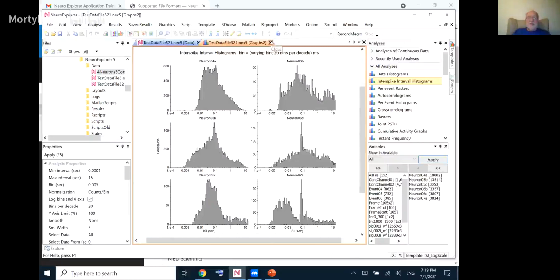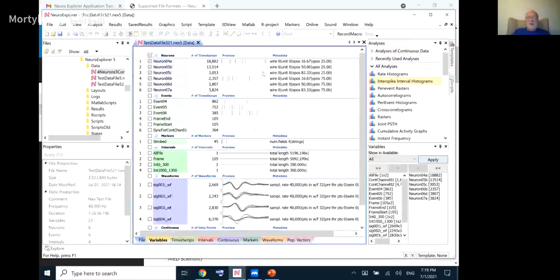The other thing I wanted to show you, let's talk about how you select variables for analysis.